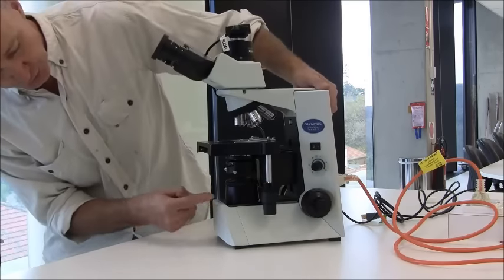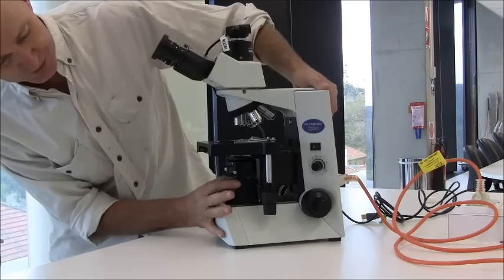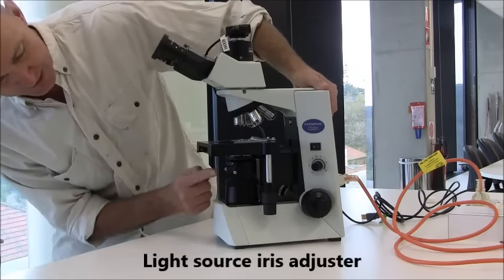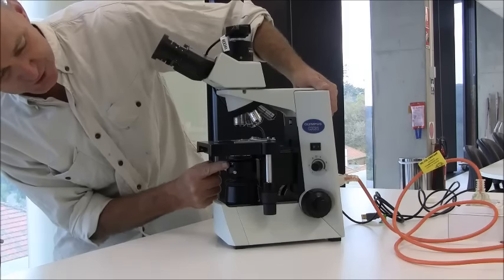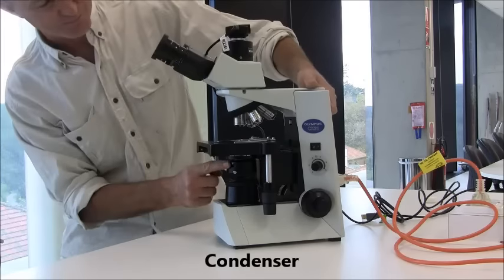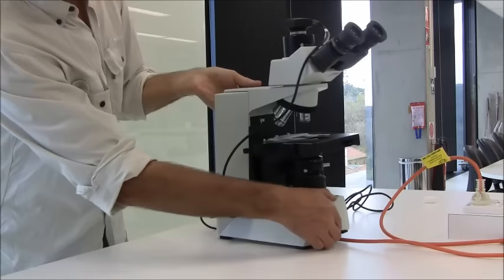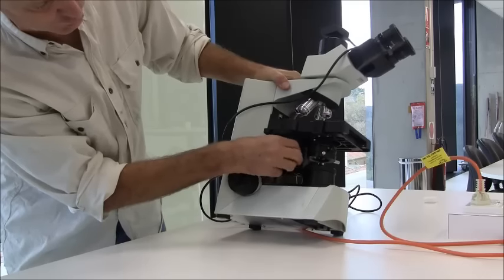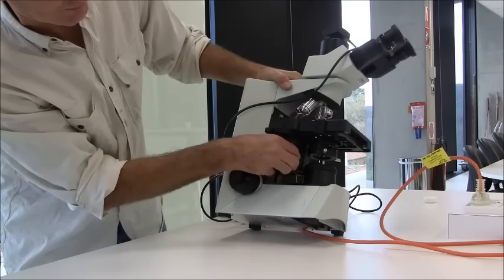As I mentioned earlier, here is the light source. There's an iris diaphragm on top of the light source we'll talk about in a minute. Here is a series of lenses called the condenser. Now that is adjusted using the knob on this side of the microscope. And we'll talk about adjusting the condenser in a minute.